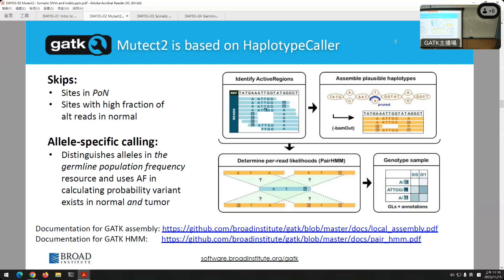If there are two overlapping reads that might disagree on what it is there, well, we toss them both. Again, we're aggressive in tossing information there because, like Eric mentioned, even the act of storing the cells sometimes has a tendency to degrade the DNA. Okay, so we want to be really sure, we have a high threshold for calling anything on that side.